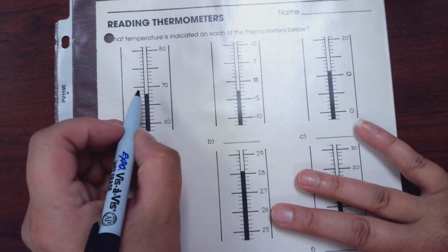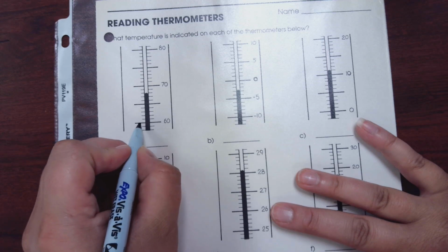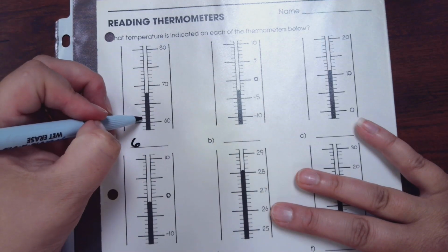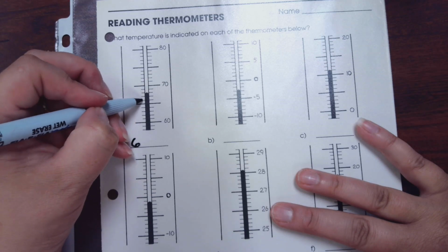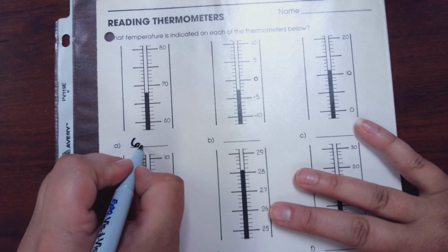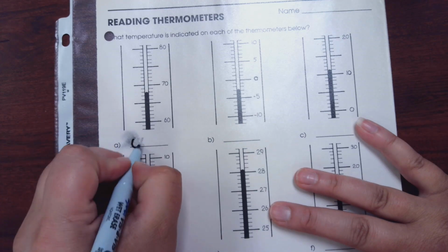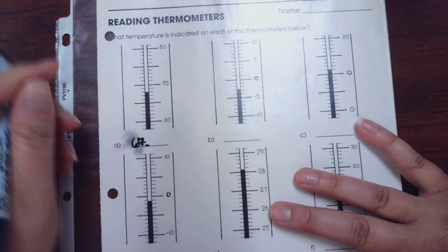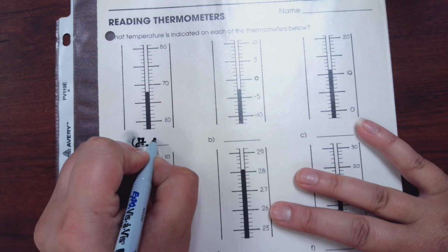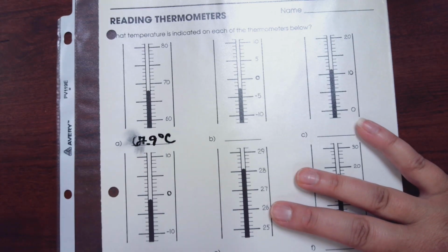So here we have our thermometer, and see how it's kind of a bubble? We want to read from the very, very tip top of the bubble. So we know that it's at least 60, but not quite 70. So we're going to put the 6 for 60, and then we're going to count 1, 2, 3, 4, 5, 6, 7. It's past the 7, but it doesn't look like it's quite to the 8. So I'm going to call this 67. Now it really is almost to the 8. We're really close there. So I'm going to estimate that last digit as a 9. So I'm going to call this 67.9 degrees Celsius.